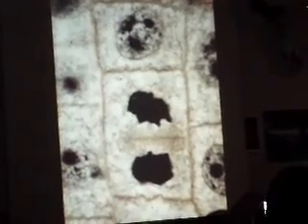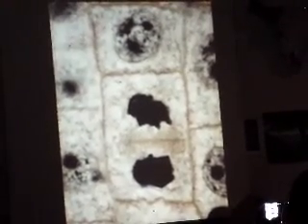What phylum? What phase? Telophase. And what's this thing? Cell plate. And what part of the cell cycle begins when that forms? Cytokinesis.